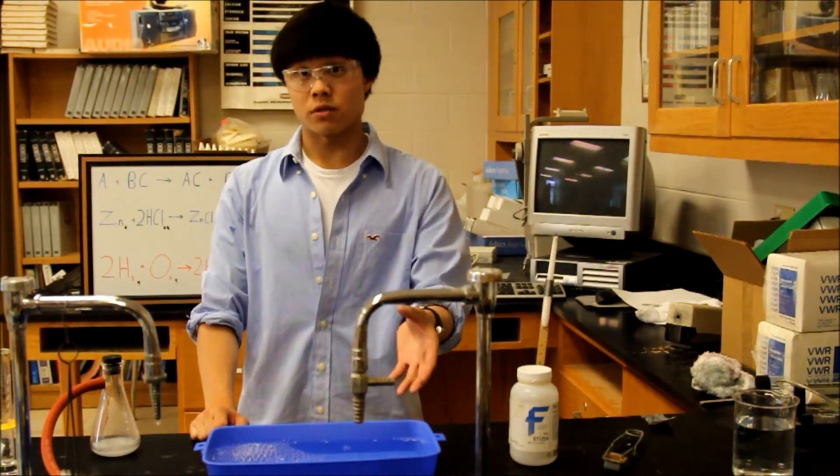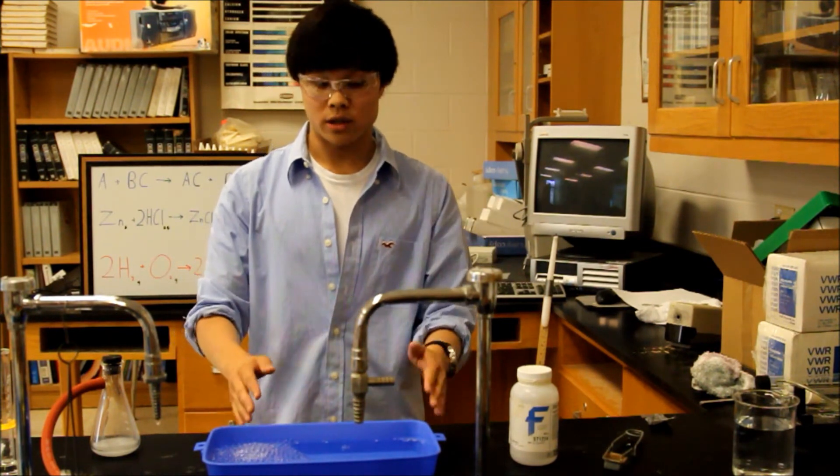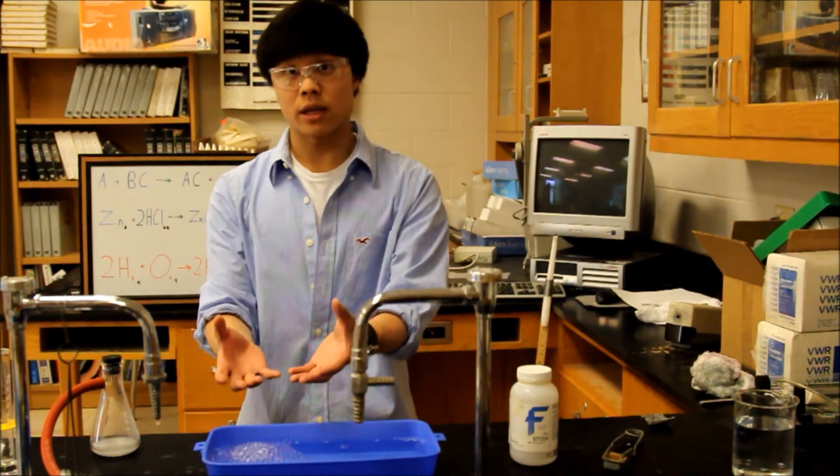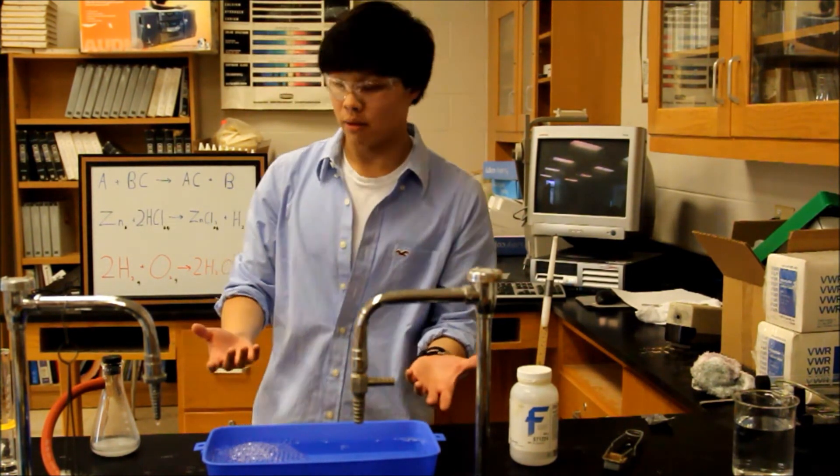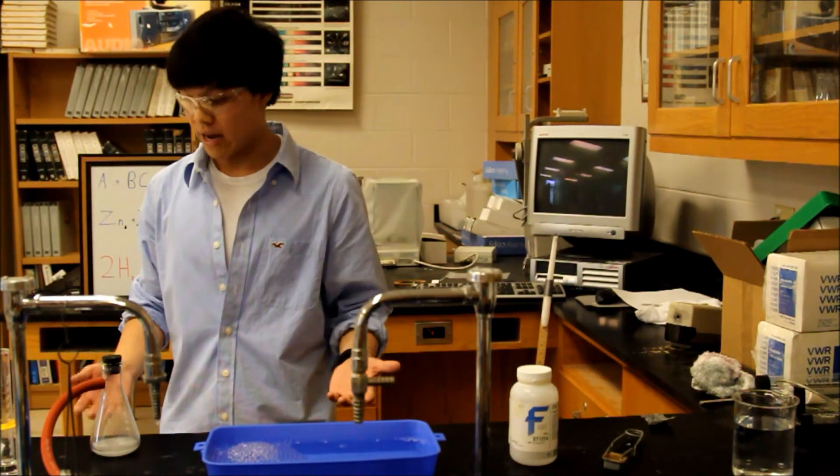You may be wondering what the dish soap was for. The dish soap creates a level of high surface tension inside the gas collection tub, keeping the bubbles in line so we can light them on fire, rather than having the hydrogen go straight up into the air, as it's a lighter-than-air gas.